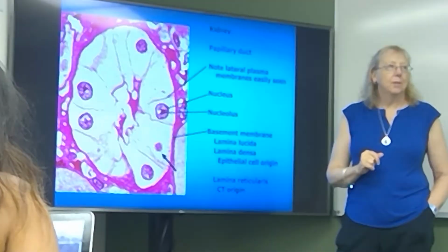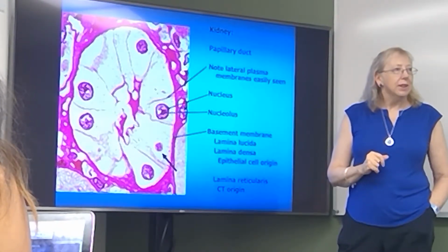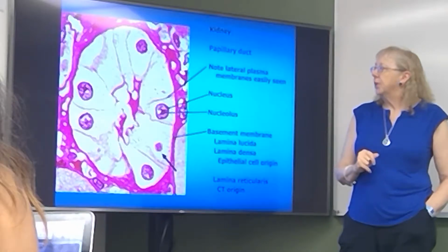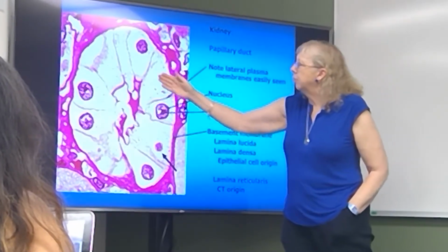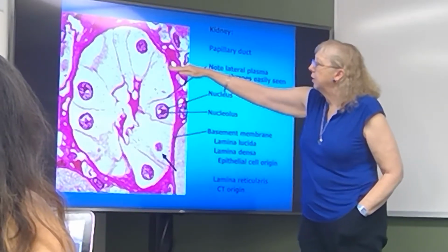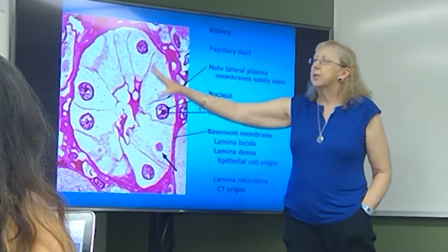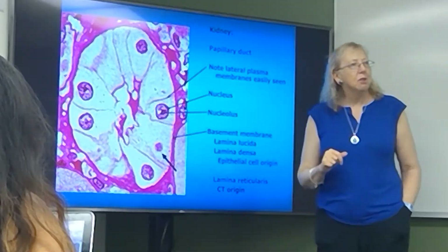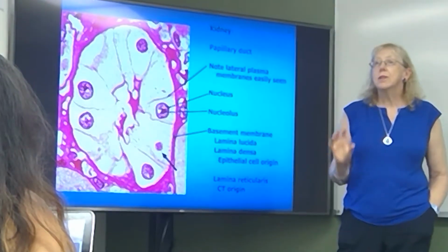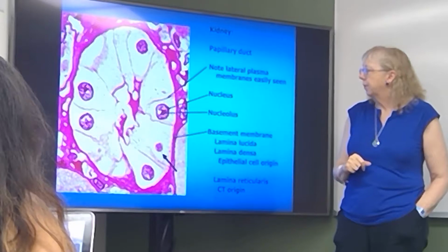Is the nucleus missing? Well, they probably still have a nucleus. But as you will see, and as we'll explore in lab tomorrow, if you make a section through a cell such as here, you're not going to see that nucleus. So if everything else looks all right with the cell in relation to its neighbors, it probably has a nucleus somewhere. It just wasn't in that plane of section that you were able to cut.